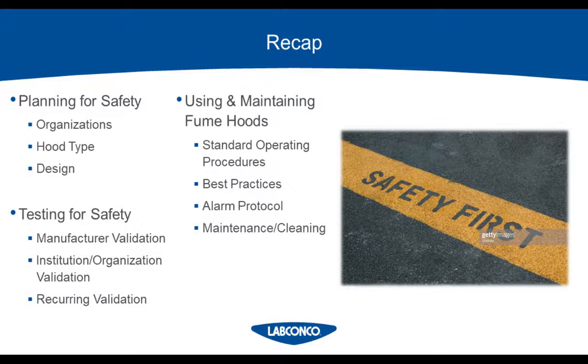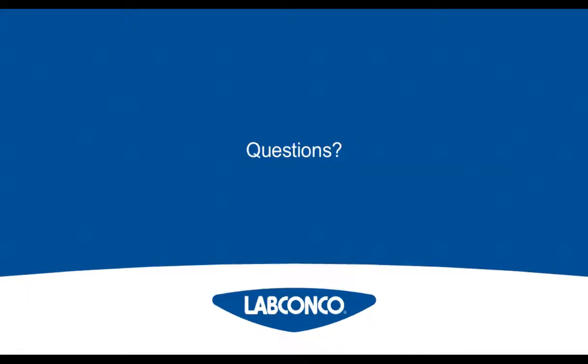Knowing that we have standards as a manufacturer that we need to follow, so those are validated, verify those before you make a purchase, and then your own institutional, organizational requirements, and then the recurring certification processes, and then creating procedures, the best practices, training tools, how to understand what's happening when an alarm is going off and what the steps are to work on those, and then maintenance and cleaning.